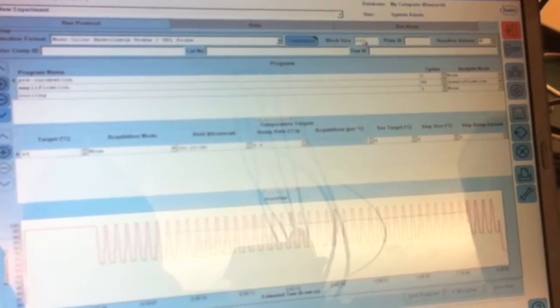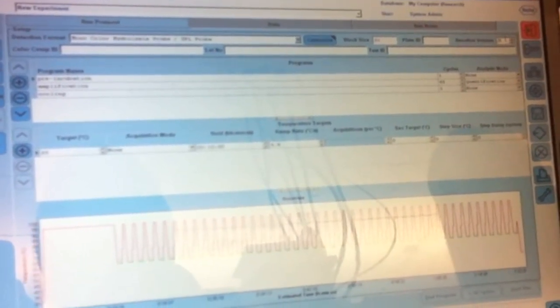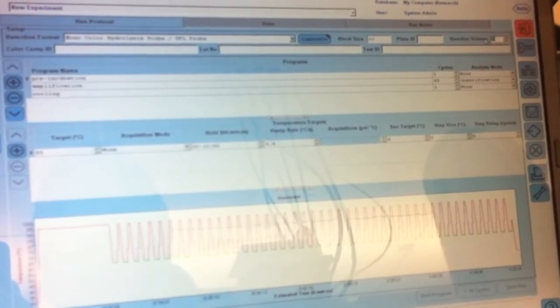Next, check the size of the block. Make sure that it is 96 wells. And enter in the reaction volume that you have for each well. In this case, we have 25.